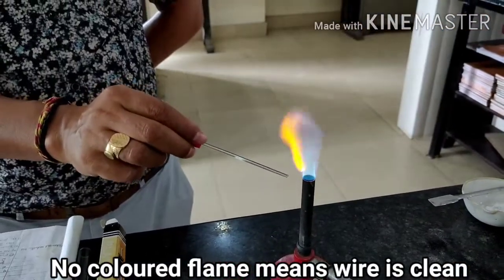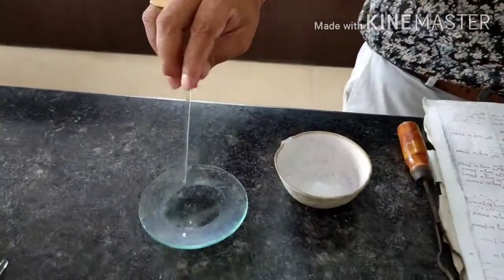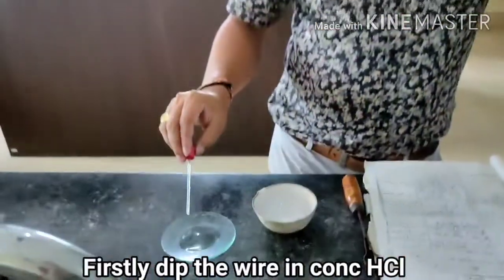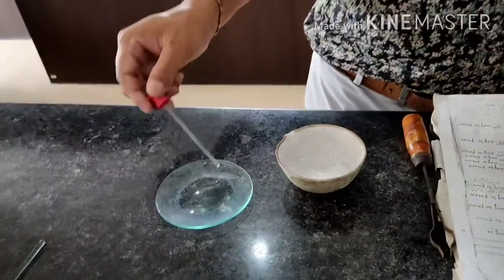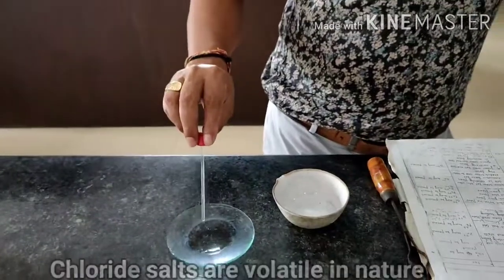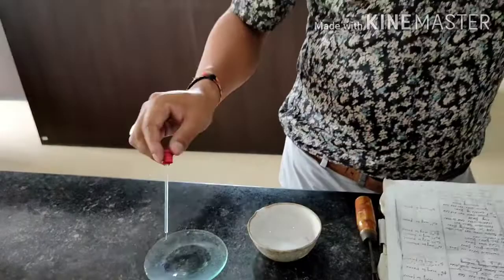If you get some other color, that means the wire is contaminated with something. Like this way, you can clean the wire. Now the wire is clean. How to do the flame test? After getting the salt, you use the platinum wire. First, you dip the platinum wire in concentrated HCl. HCl is always used — you cannot use other acids. HCl is used because it produces some chlorides, and chloride salts are volatile. That's why you can see some colored flame. If you use other acids, you don't get the test.